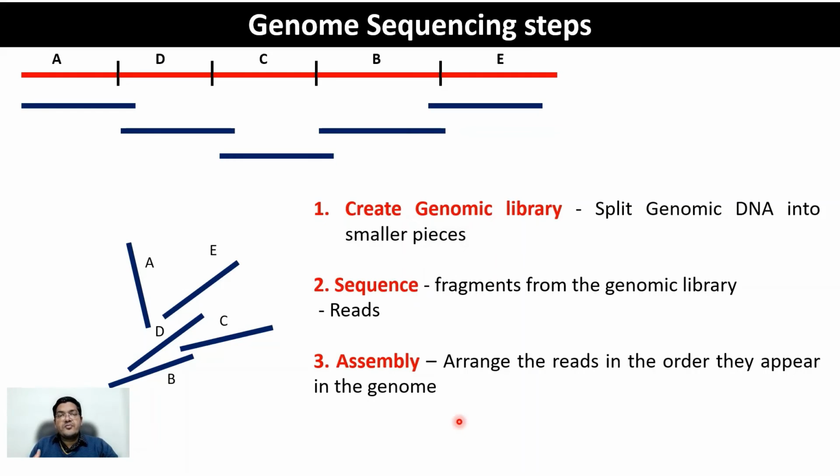And so to simplify the problem, you create multiple small problems and find individual solutions to each problem, and then all solutions are put together to finally get the original DNA sequence in the order it appears in the original genome.